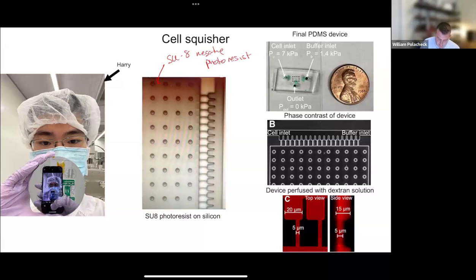So one of the important parts in the functioning of this device is that it certainly has to constrain the cell in this direction, in what we might call the XY direction. But we also need to make sure that coming out of the page, this device is not so thick that it's not squishing the cells sufficiently.